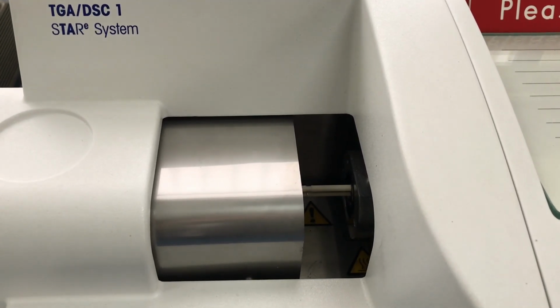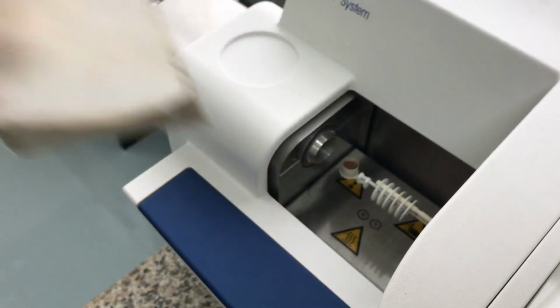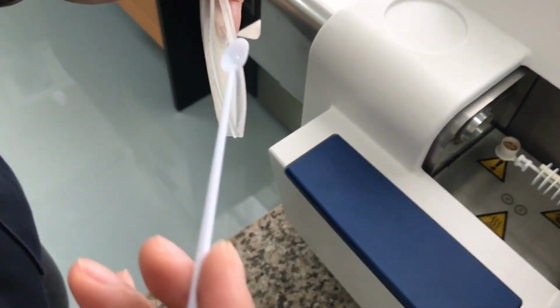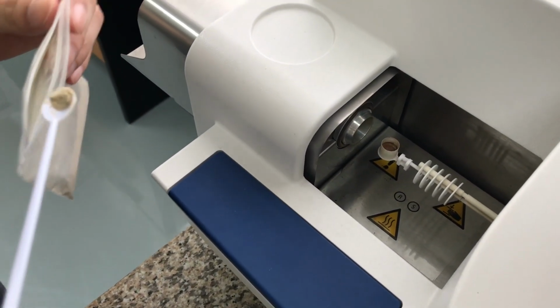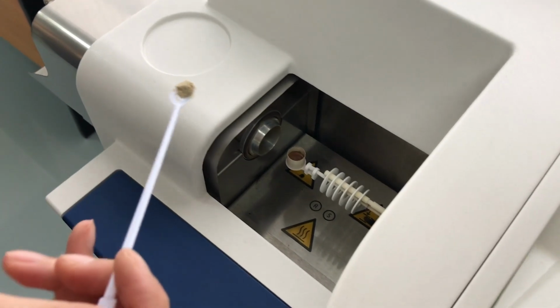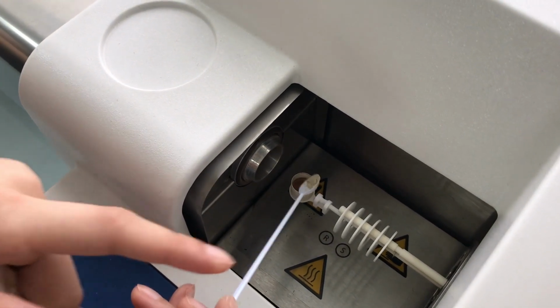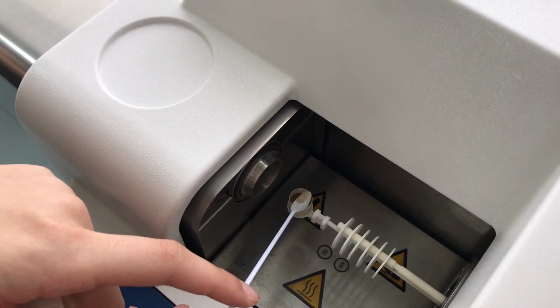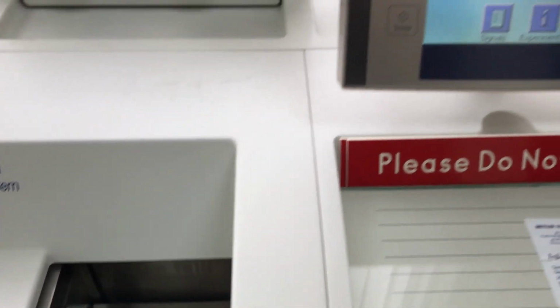We will put the sample around 15 mg. In this experiment, we use pure rice husk. Put in the crucible. After it is 15 mg, close the furnace.